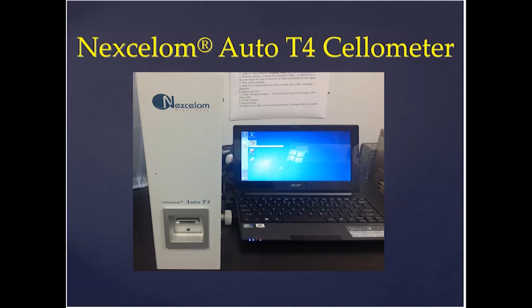It is attached to a laptop. Another important piece to point out is there's a focus knob that you find on the side of the cellometer, as well as an opening or slit in the front, in which you will apply the sample slide.